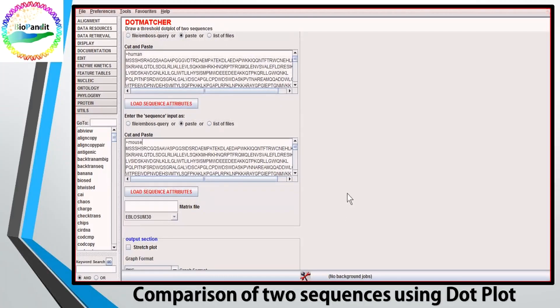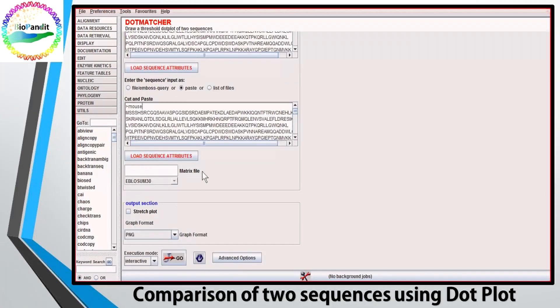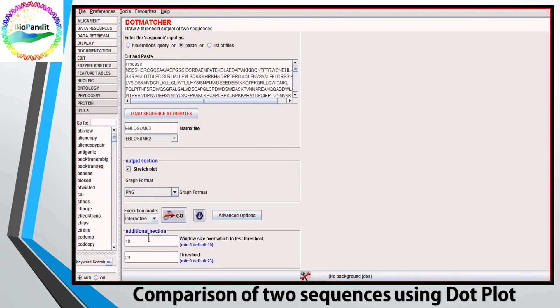Set your substitution matrix file. I am going to use BLOSUM62. Select stretch plot. Set the graph format to PNG. Go to advanced options. Set the window size to 100 and the identity threshold to 50%. Set the execution mode to interactive and hit the go button.